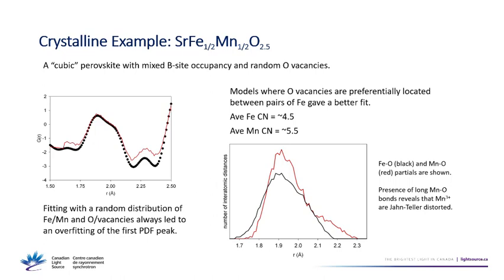It wouldn't be as much contrast because it's, you know, a positive one versus a more positive one. And so there would still be an effect. Like the total intensity would depend on the ratio. But in this case, because of the negative value of the scatterer, it was very pronounced. So if you had really good data and a big contrast in the weight of the atoms, you might see a little effect, and you could try to adjust it to match, but it wouldn't be as precise.